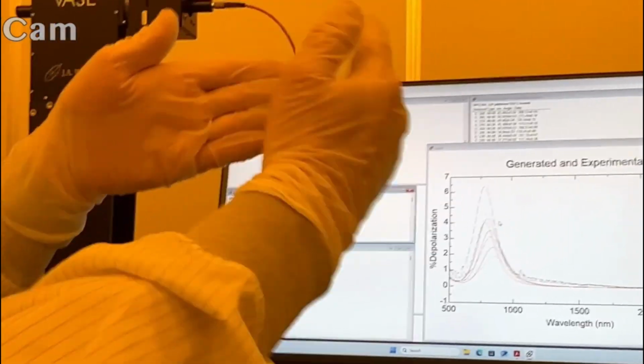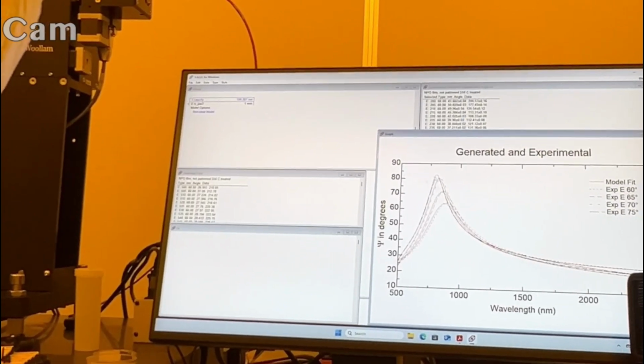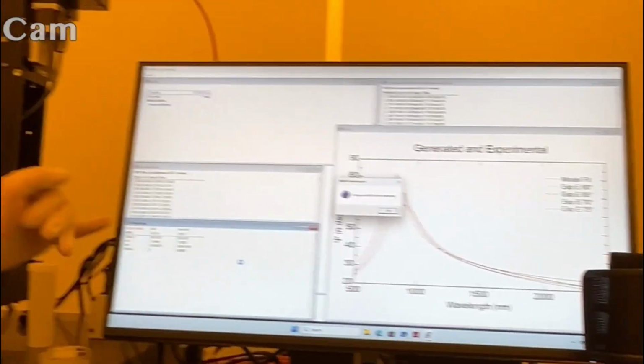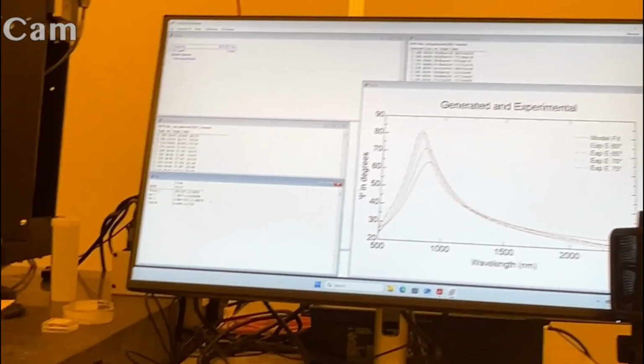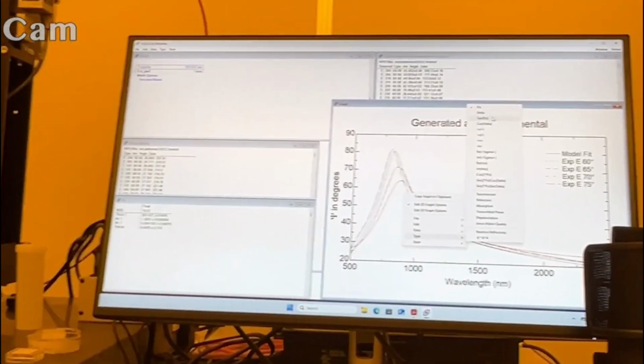But if your beam spreads and it's more non-uniform over here versus over here, you might have a difference there. So these are a little bit minor at the moment, but that's part of the misfit here. If I had changed some stuff here, my thickness was right at 200 or so before. So if I add some thickness non-uniformity, I probably have a little bit better MSE. We're not perfect, but we're closer.